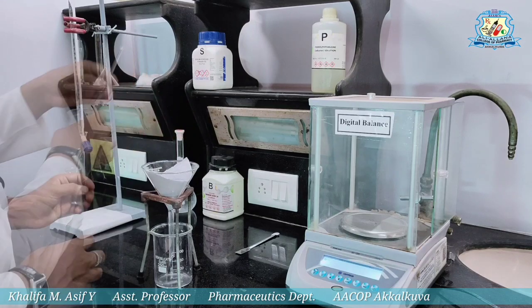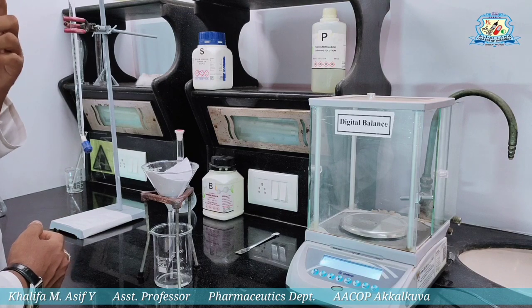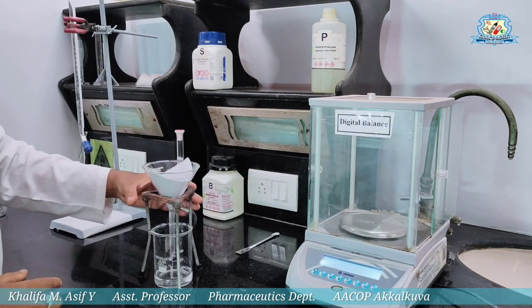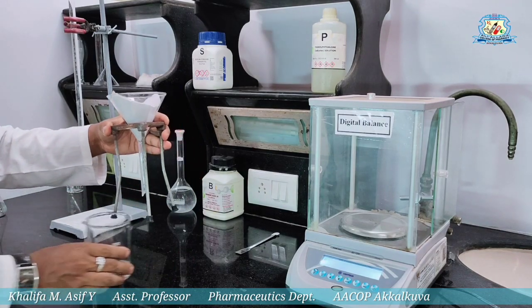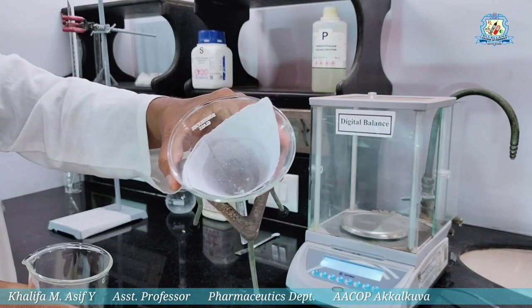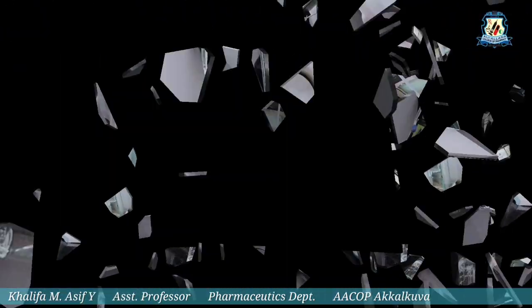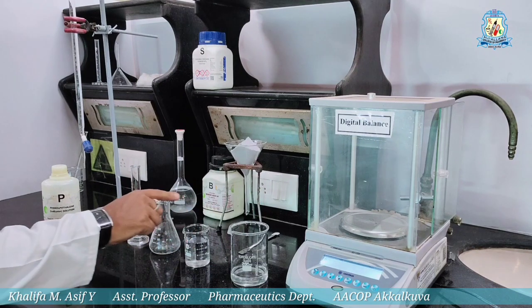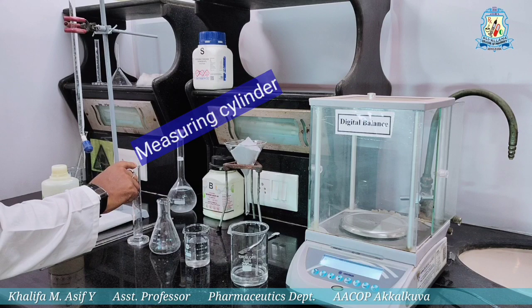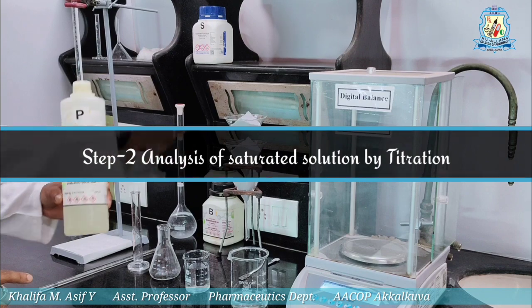Remember one thing, before going for filtration, we have to cool our solution to room temperature, because our aim is to determine solubility at room temperature. So I am preparing saturated solution by using the second method, which I have discussed in the theory part. This filtrate is the saturated solution of benzoic acid, and you can see the excess of benzoic acid is separated out by filtration. For the next step, we have saturated solution, distilled water, conical flask, measuring cylinder, pipette and phenolphthalein.